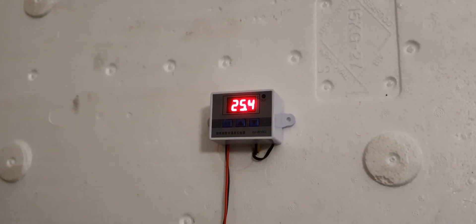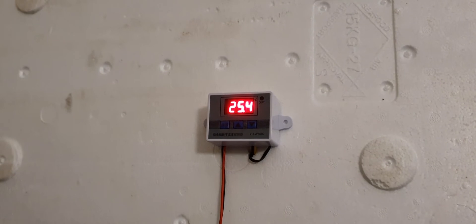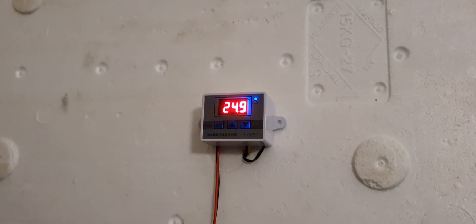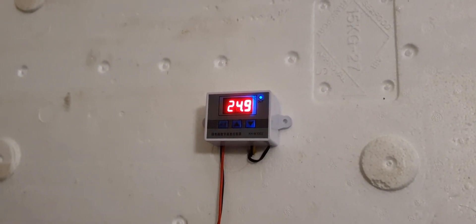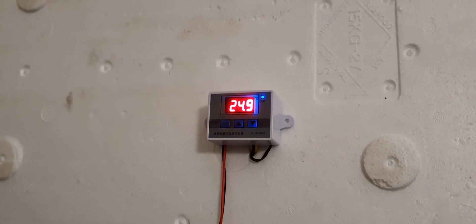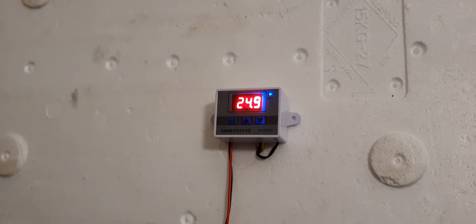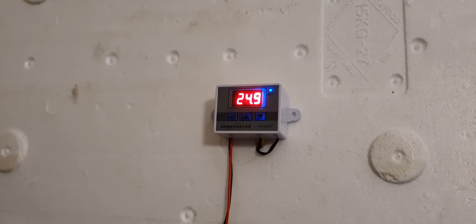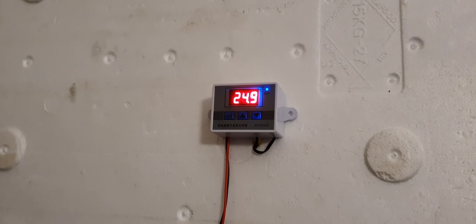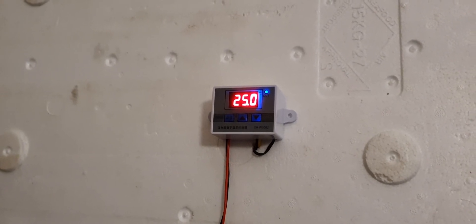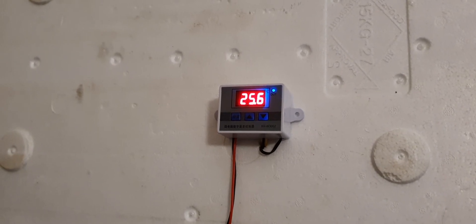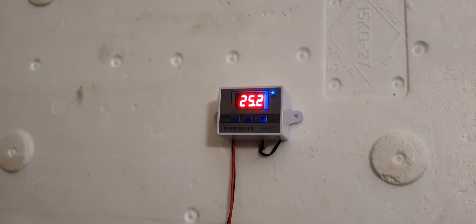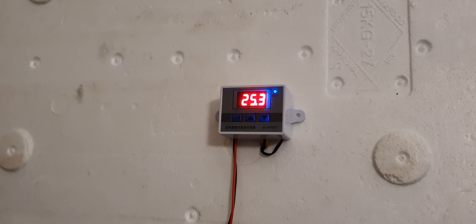This is a real-time kind of estimation or display of how long it takes for this to actually heat up. I'm planning on making some more videos in the future looking at making an OD600 to do optical density measurements for bacteria cultures and other cultures, and I'll be just testing this and keeping an eye on it. You'll know if it's still working and if it's safe to use because I will make a video sometime in the future, and if I don't then the house is probably burnt down but fingers crossed. Hope you enjoyed it and stay tuned.